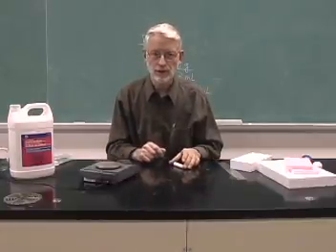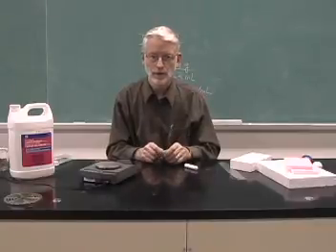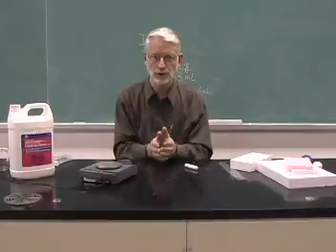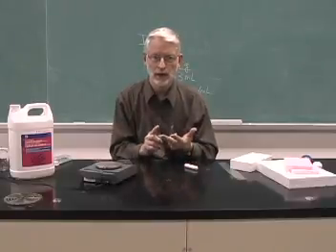For safety reasons, it's best that the teacher do the methanol density rather than having all the students do it, because methanol, when it's spilled, can create vapors which may be hazardous to children. And so you don't want to have any methanol spilled in the classroom, but nevertheless it makes a great demonstration for the teacher, and it's important for students to realize that different liquids have different densities. And here they then calculate the density of two different liquids, water and methanol.